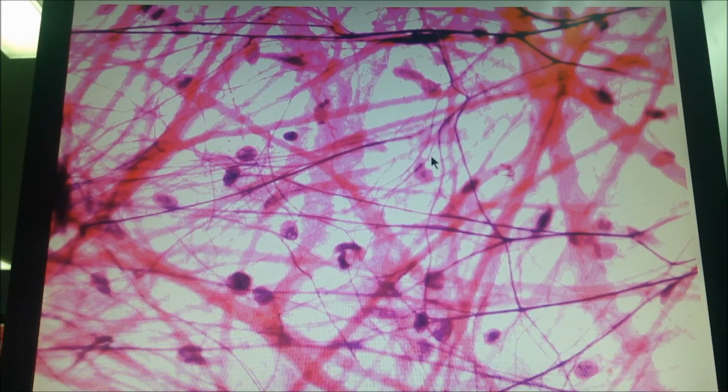Over here نيجي نطلع على هذا. This is a very characteristic section. وخلص لازم تعودوا حالكم على هذا الimage. Do you know what mesentery is? Mesentery هو عبارة عن thin membrane that surrounds the intestine. بالعربي بيسموه المساريق، شيء رقيق حوالين الintestine.